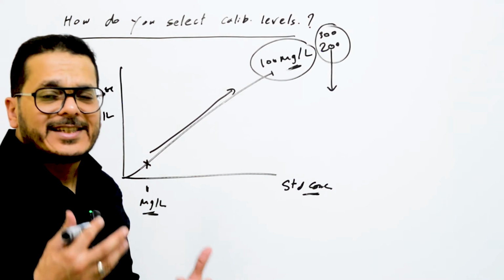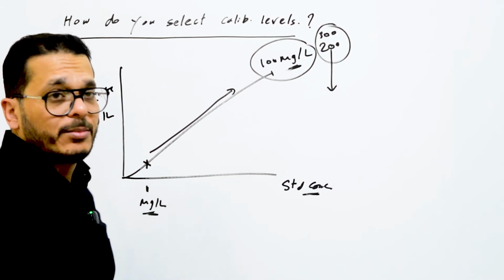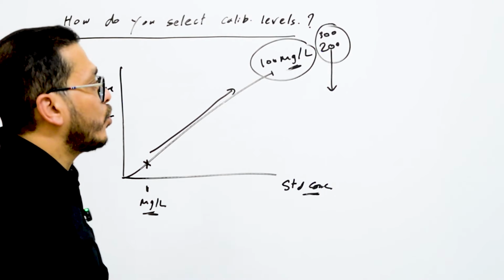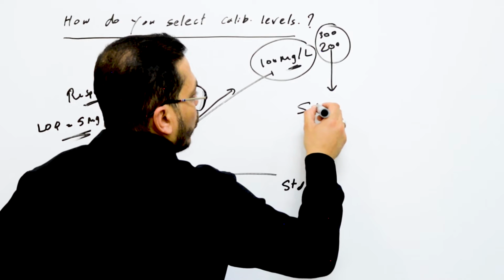When you receive the instrument and start running some standards on it, you will check a very important point, which is the saturation point.